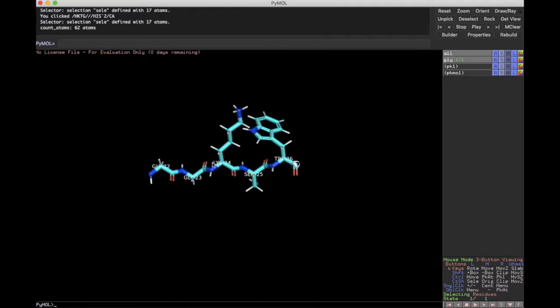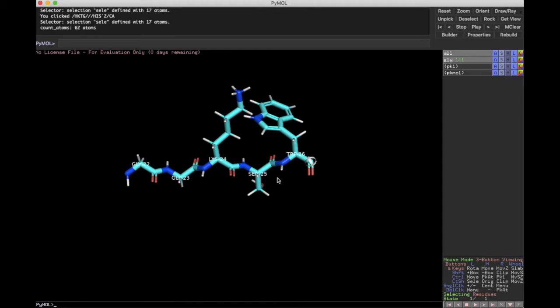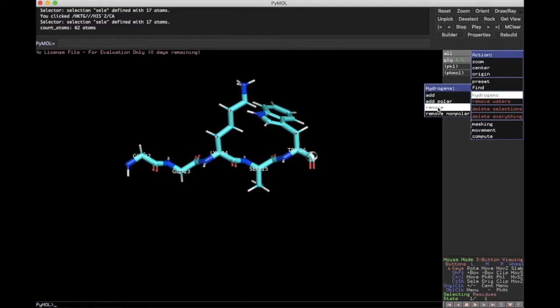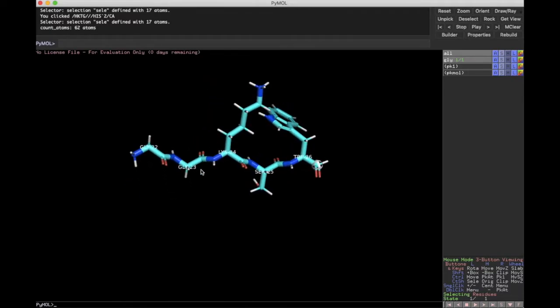And what I'll do now is, if we look at the N-terminus, for example, a nitrogen atom generally has 3 bonds connected to it. Right now we only see 2 bonds, and that's because we're just not showing a hydrogen here, all right? And so what I'll do now is I'm going to go hydrogens, and I'm just going to remove the hydrogens just so we are at a 0 hydrogen state, and then I'm going to do the same hydrogen and I'm going to add them, okay? And now we're going to see hydrogens at all of the spots.